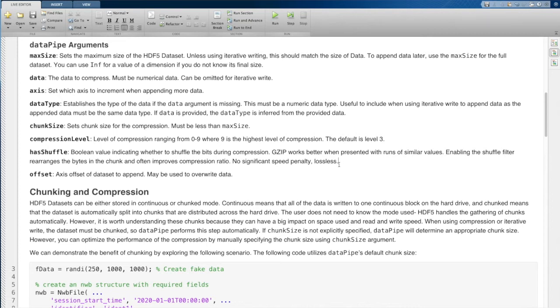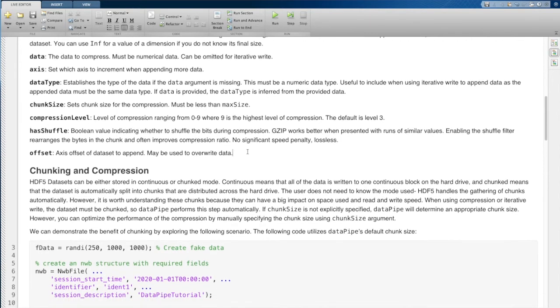It generally improves your compression ratio without much speed penalty. So in general, this is usually a good idea to turn on. It's also lossless, which means that if you compress data and then decompress it, the values that you get when you decompress are going to be the same as what you started with.